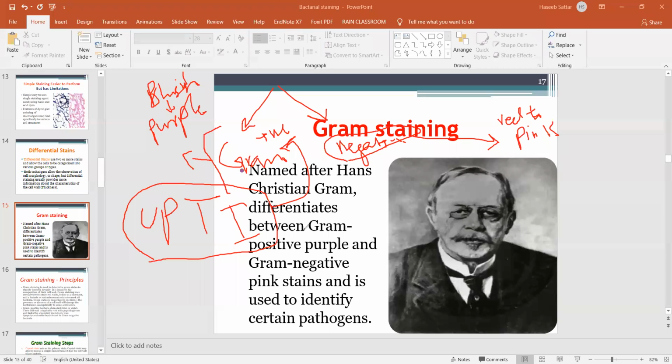So we use drugs which kill gram positive bacteria, while infections in the lower respiratory tract, like in the lungs, GIT, and urinary tract infections, are mainly caused by gram negative bacteria. So we have drugs which only kill gram negative bacteria. Look, with the help of gram staining, we are not only able to identify the bacteria, but also to choose drugs to kill these bacteria.